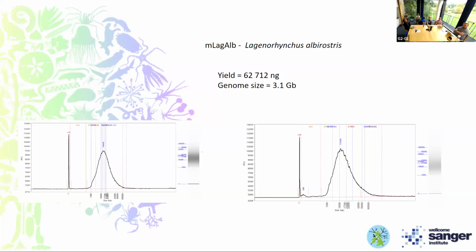This is a method that we've employed often when we are unable to get high molecular weight DNA from samples, but the fragment size of the DNA falls within the fragment range for PacBio standard library prep.